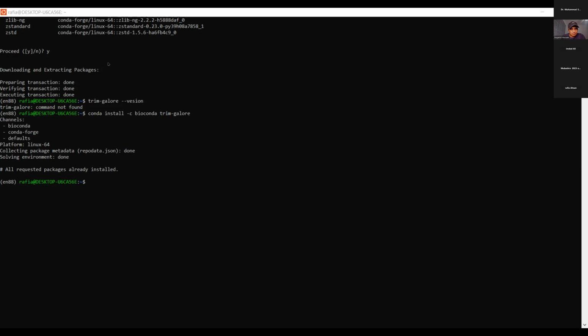So can you share the command, or how to write the command for MultiQC? Okay, type conda install star.